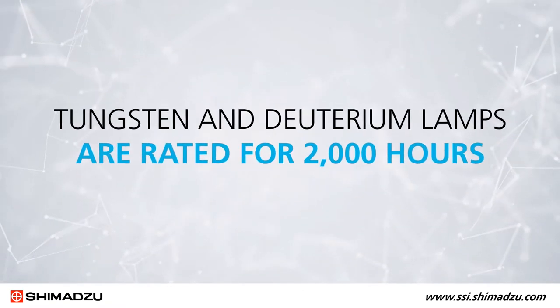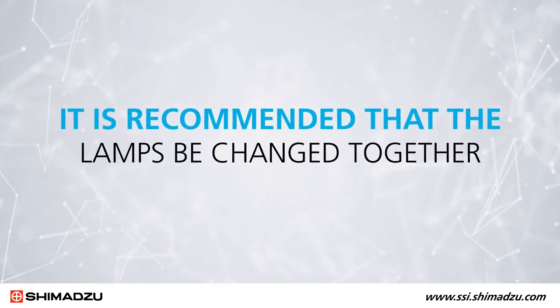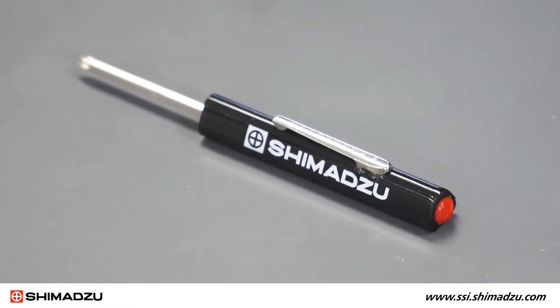Both the tungsten and deuterium lamps are rated for 2,000 hours, so it is recommended that the lamps be changed together. For this task, you will need a Phillips screwdriver.